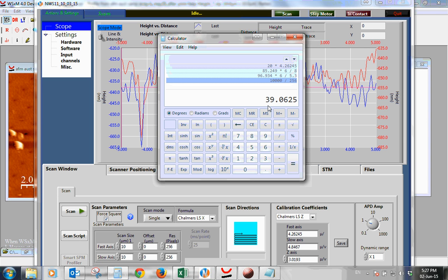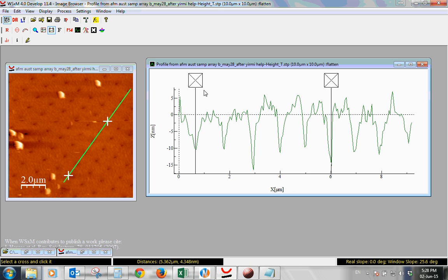So you can have a plus minus of, let's say, 20 nanometers to here and to there each scan. And of course also you have the tip size, which a regular tip size is also like 20 nanometers. So we're more or less talking about a 20 nanometer deviation. But mostly, if you can get to 20 nanometer deviation, that's a really good situation. Because also, for example, you don't know exactly if this is the center of the hole or this is the center of the hole. So you also have here a certain deviation. That's it for now.